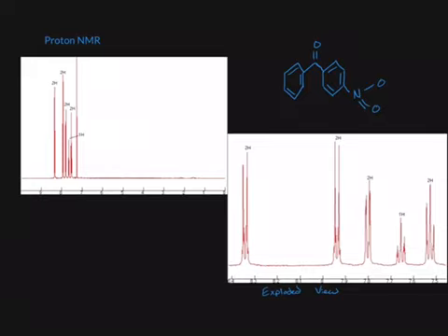And now what we need to do is make sure that we have the correct number of hydrogens. So we have 1 hydrogen here, 1 here, 2, 3, 4, 5, 6, 7, 8, 9. And we have no more hydrogens over here, none over here. We do have 9. We used up our 3 oxygens, carbons, and nitrogen, so we have actually gotten the molecule as correct as we can.